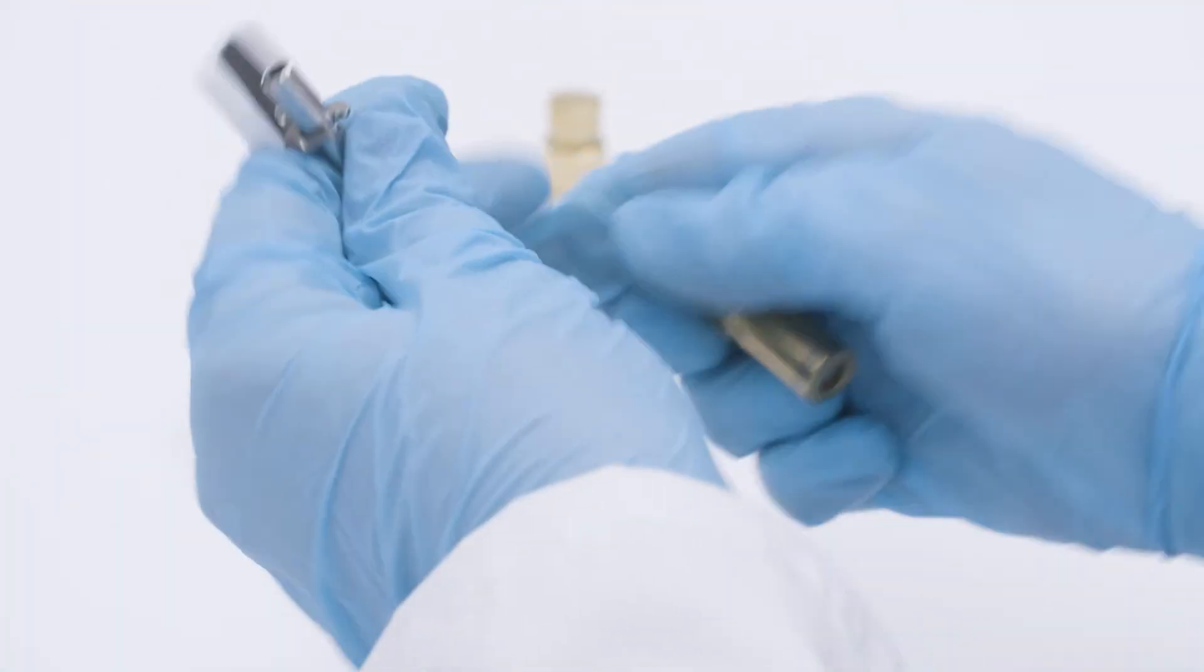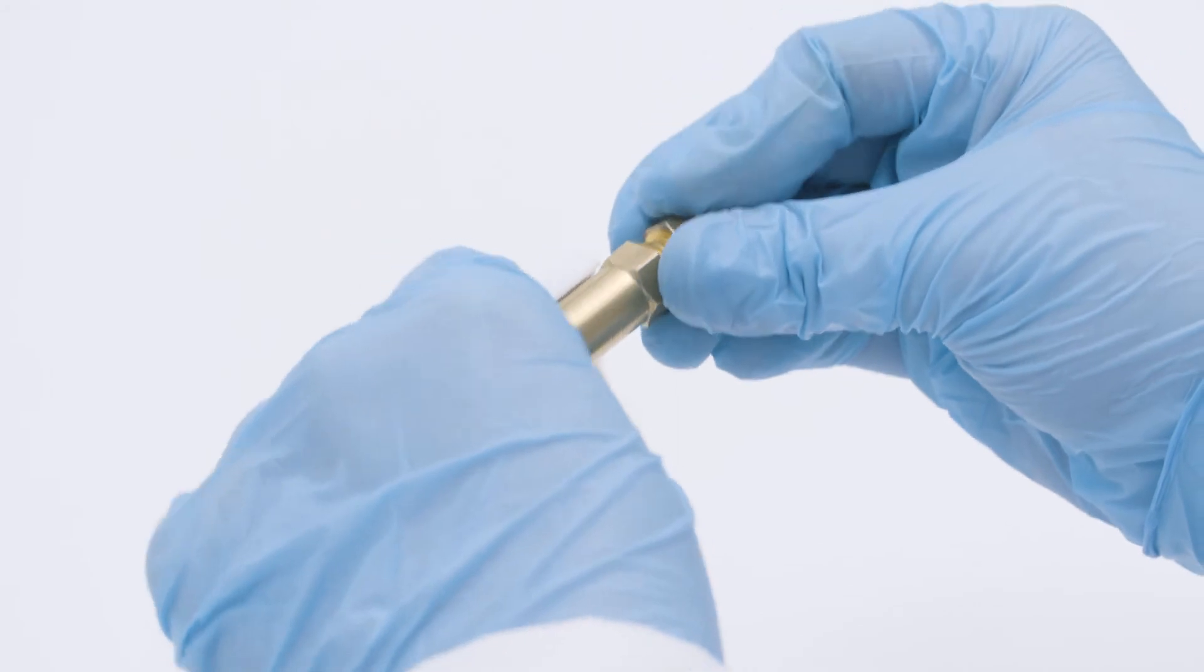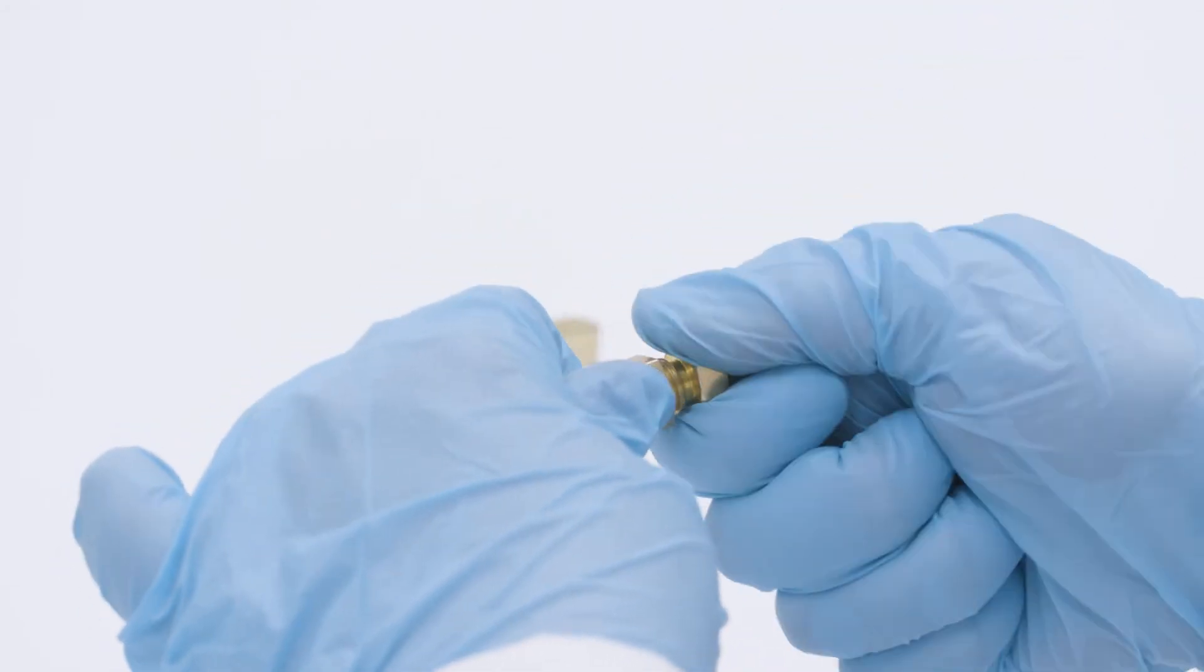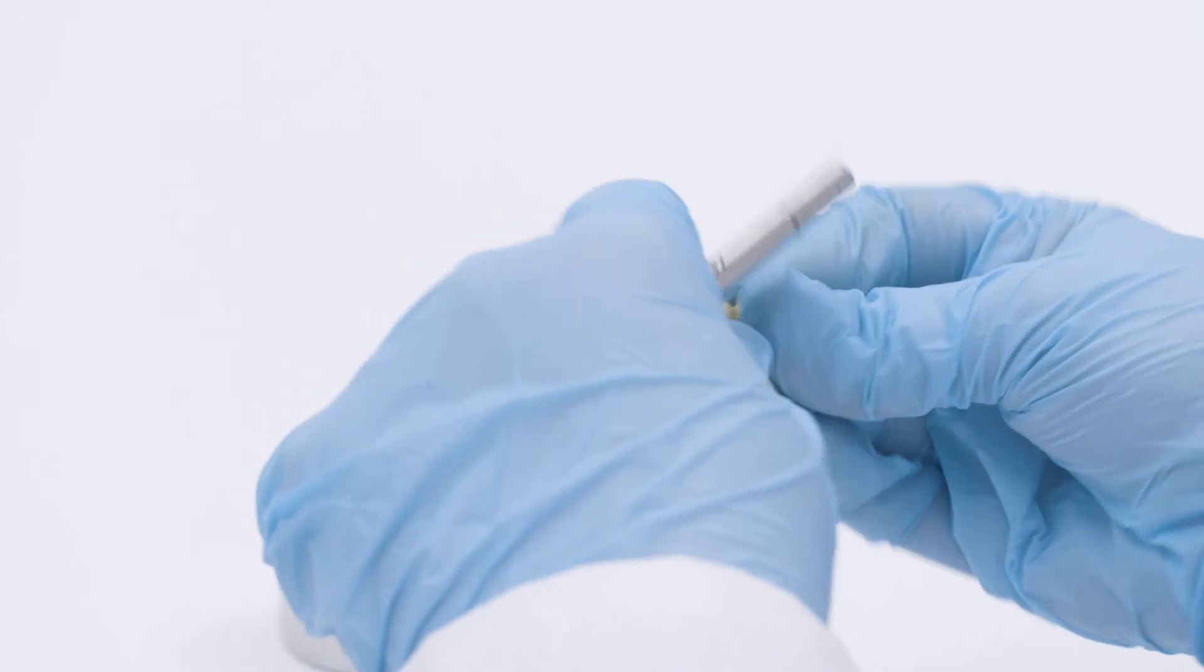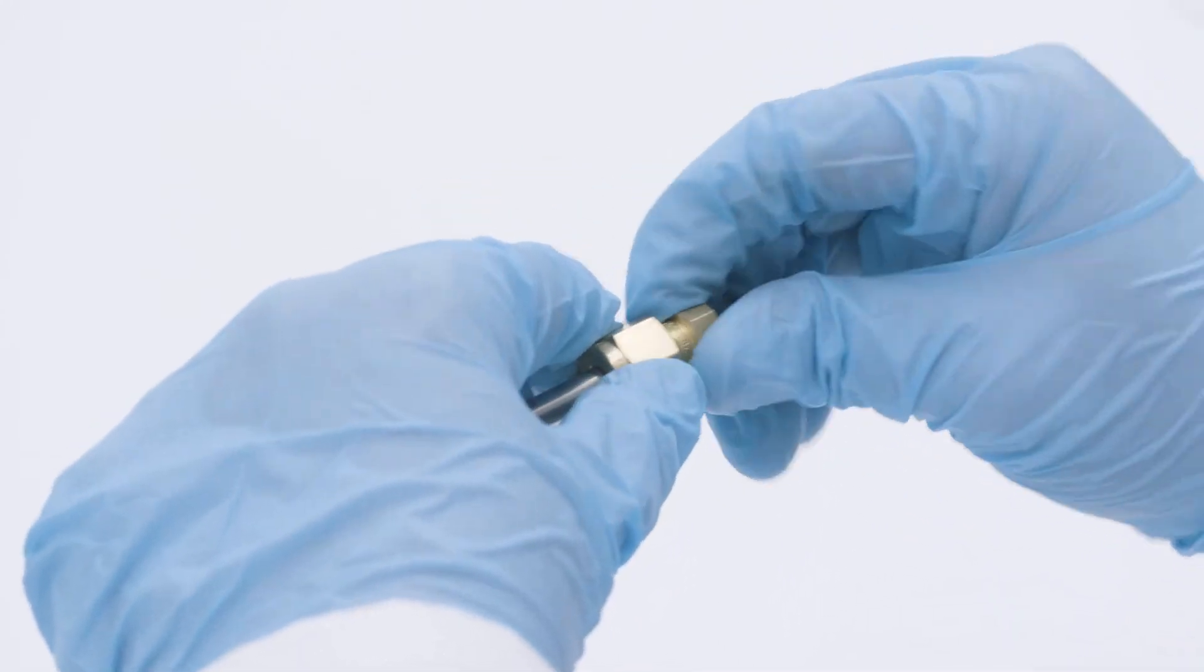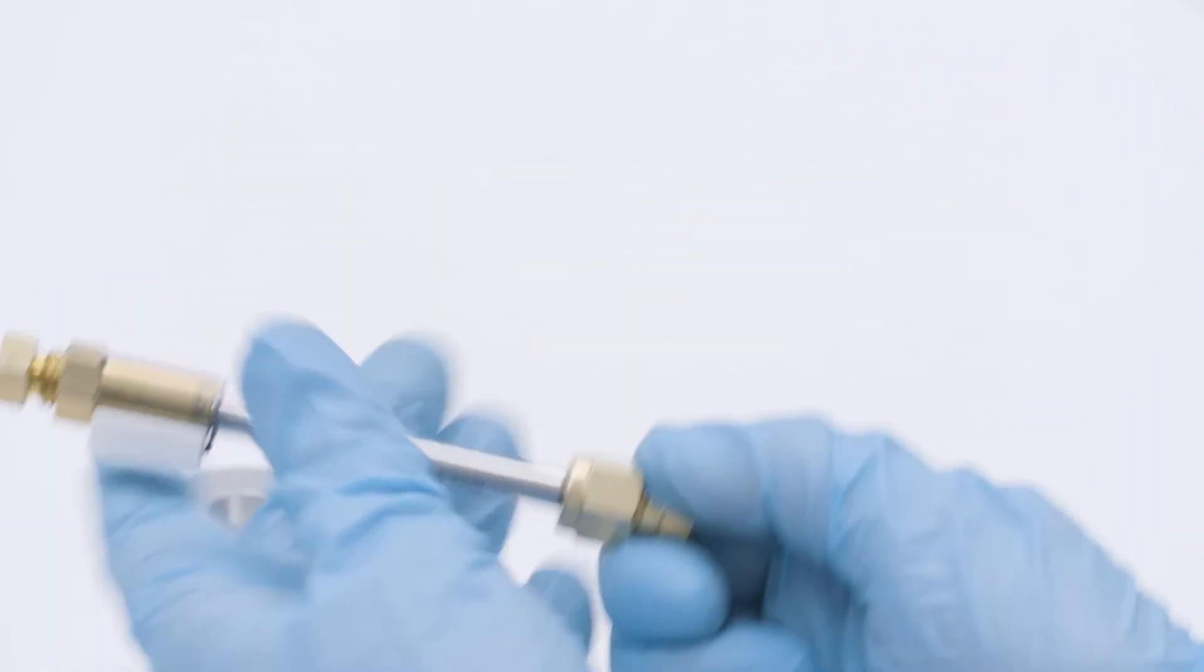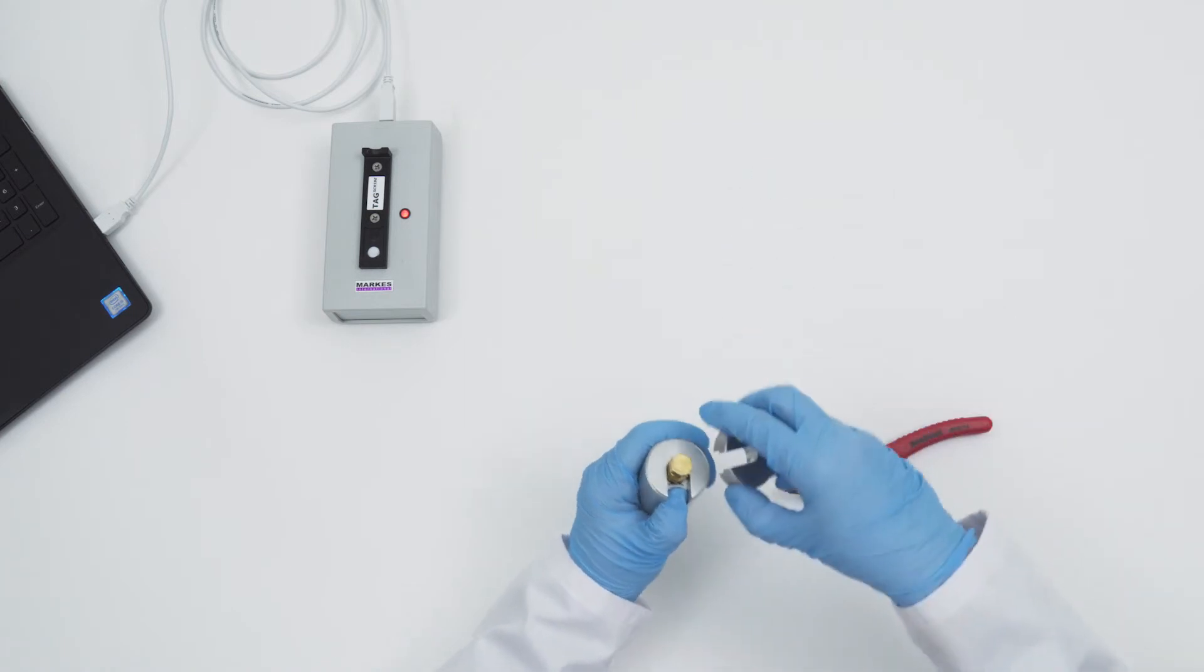Once conditioned, place a tag-ready long-term storage cap onto the non-sampling end of the tube and a long-term storage cap on the sampling end. Finger tighten each cap before quarter turning using a TagLock tool.